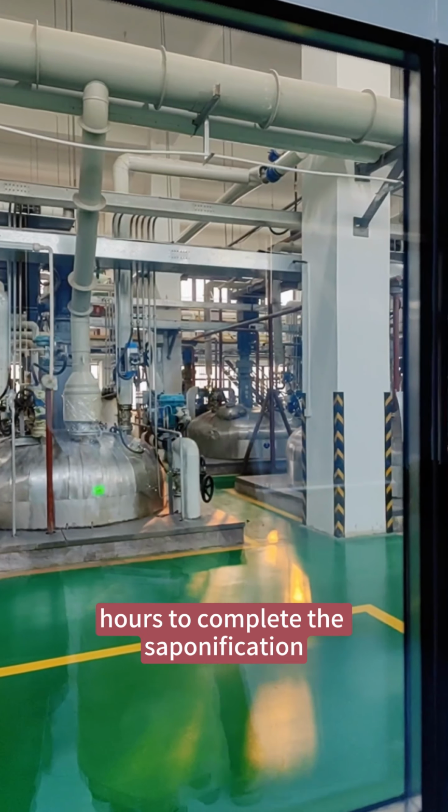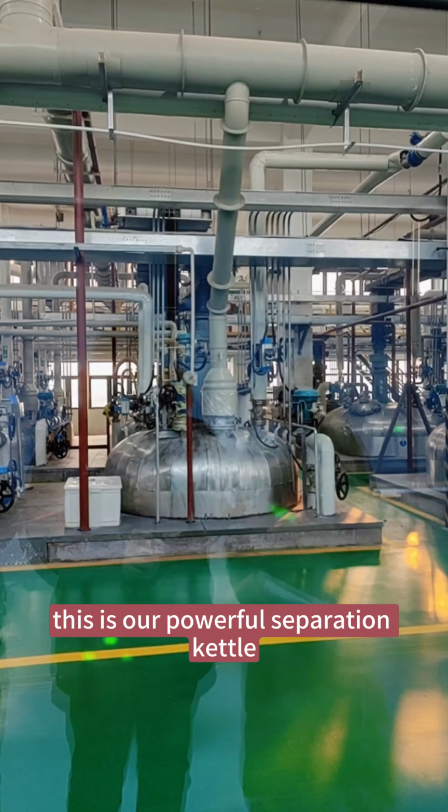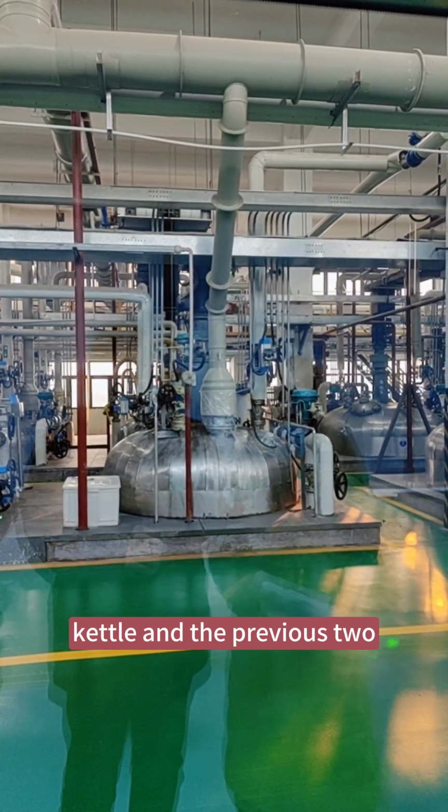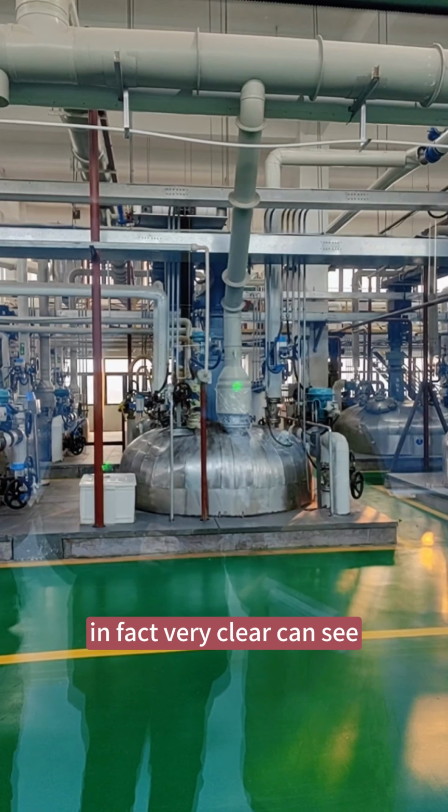This is our powerful separation kettle, which is the most efficient. Now it takes 10 to 12 hours to complete the saponification. This is our independent function. This is our powerful separation kettle. You can see that this separation kettle and the previous two kettles are configured differently. The valves are different. In fact, you can see it very clearly.